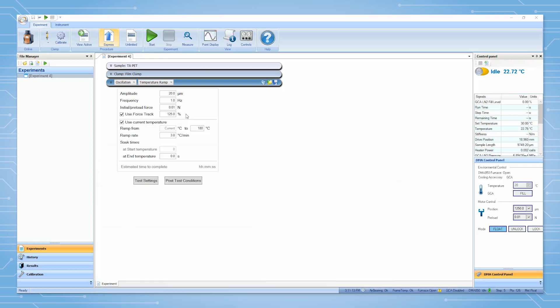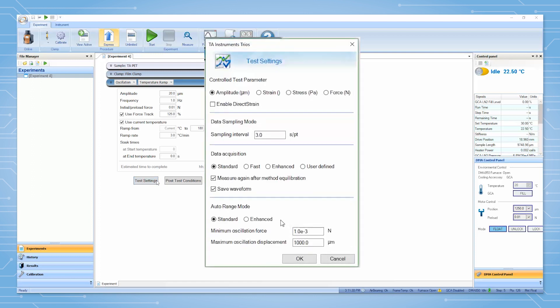The tension clamp will also have an additional option to measure the length after the initial temperature equilibration in the test settings. This option is called measure again after method equilibration.